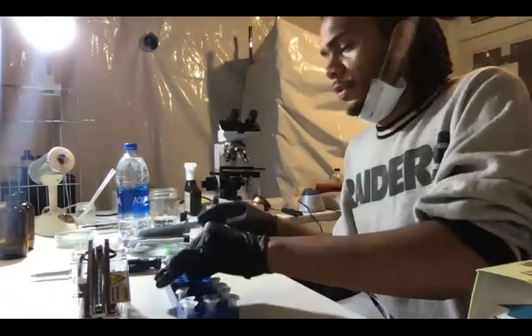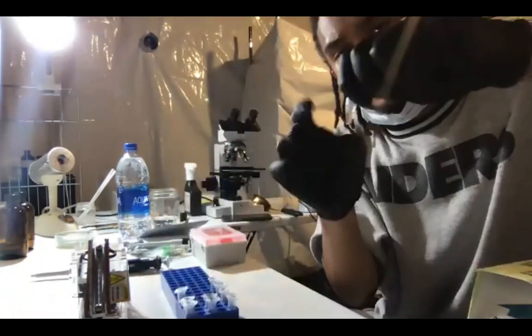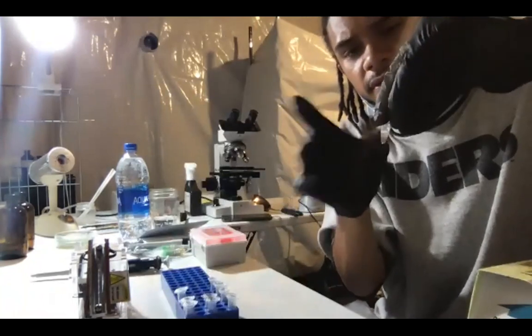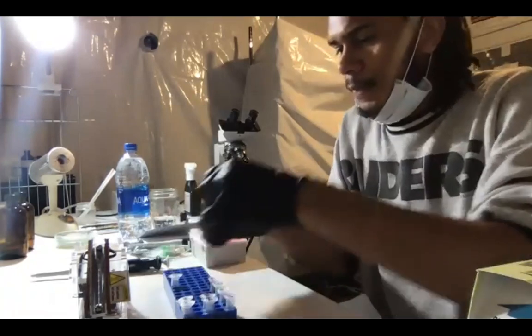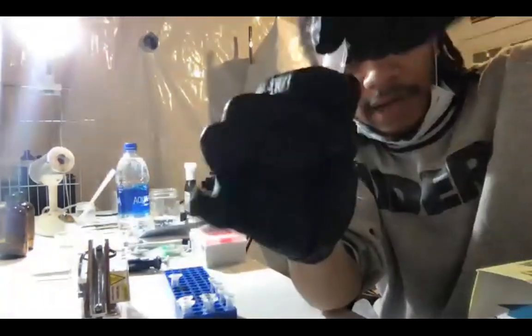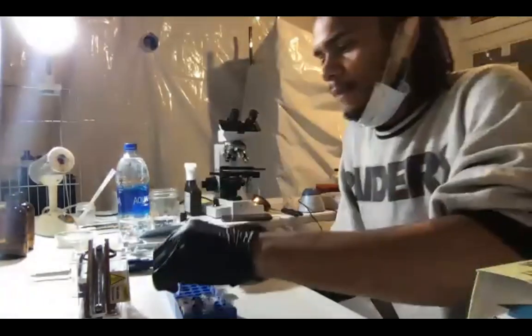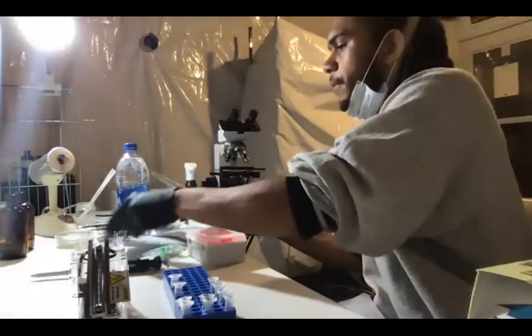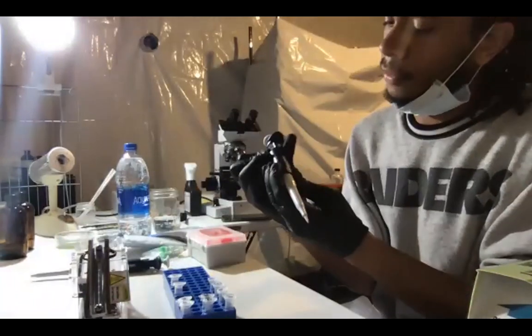All right, now make sure you got this all mixed up. I just give it a flick. There's enough liquid in there that it can mix up with itself. You don't need to do all the centrifuging and everything like that. Just flick and the liquid will jump all around in there. It'll get itself all nice and mixed up. Now, what you need to do is take your smaller pipette and turn it to 1.